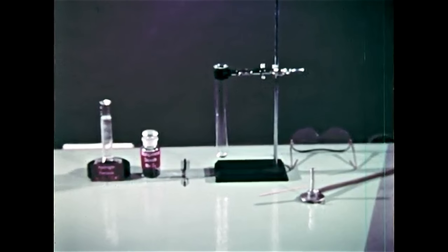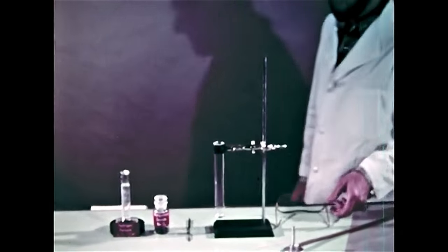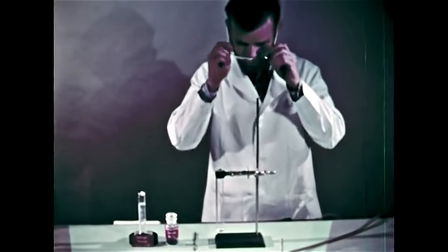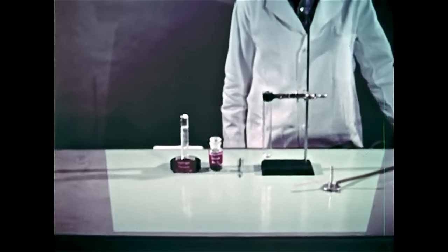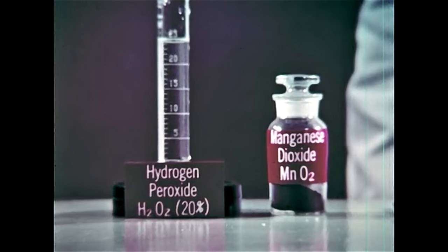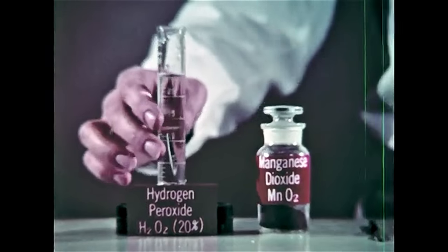This time we'll collect oxygen from a stable liquid using a catalyst. Although there are still unknowns in the catalytic process, it is thought that the catalyst provides handholds for the reactants to grab onto. We're using hydrogen peroxide for the liquid and manganese dioxide as the catalyst.